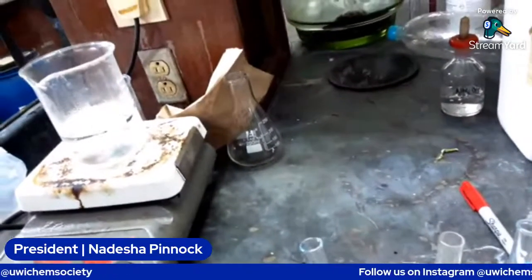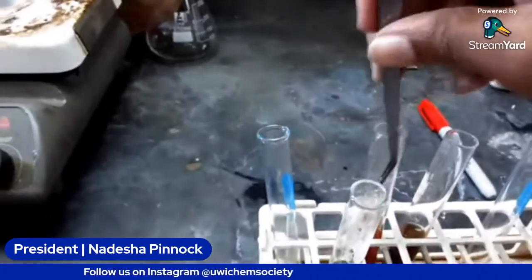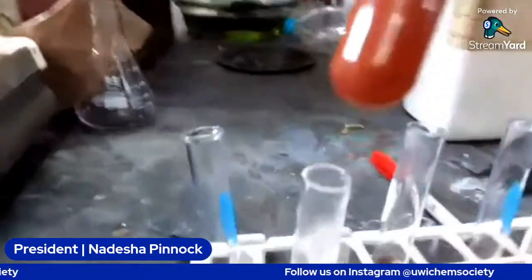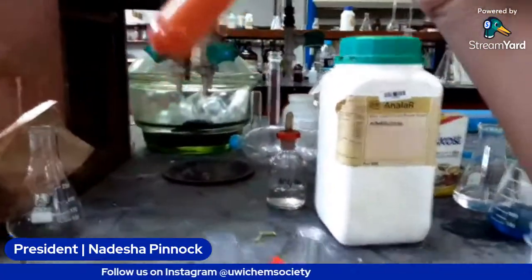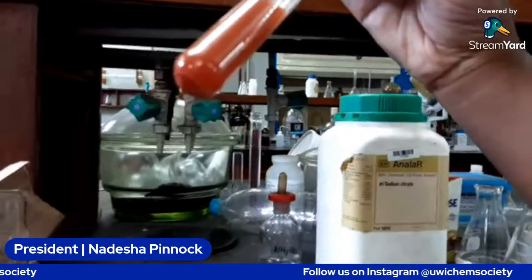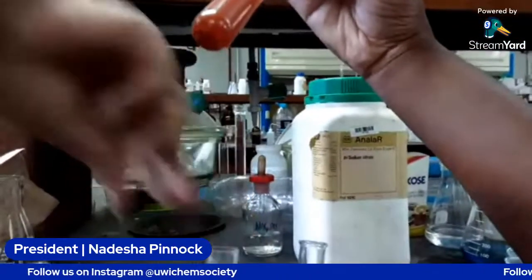This one is nice and red. There is a precipitate. Let me turn it around so you guys can see. It's a bit difficult to see because the color of the solution is almost the same as the precipitate, but if you look closely, you should see the precipitate in the bottom of the test tube.